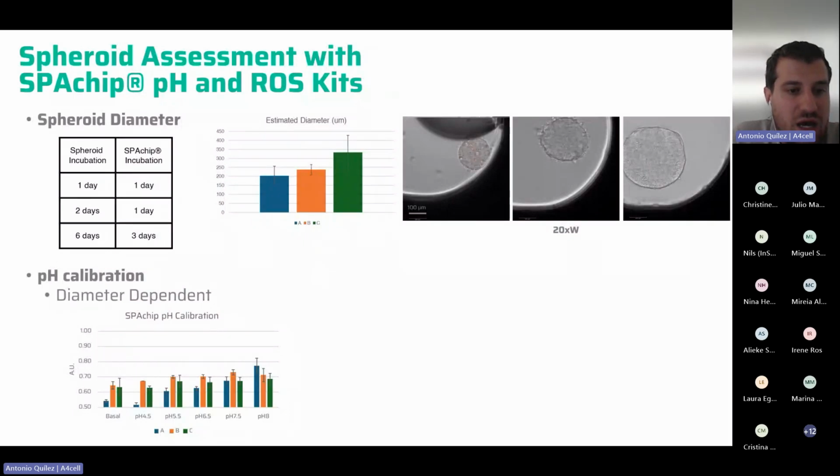We can have a very good discrimination of the different pH calibrators and a very nice calibration curve, whereas the values get quite closer to non-significant for model C. That's depending on the time you allow your treatments to go in.